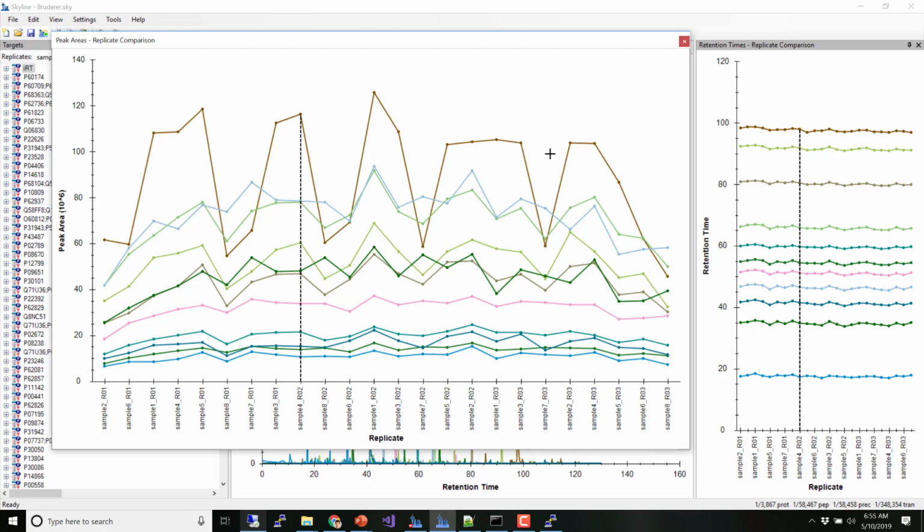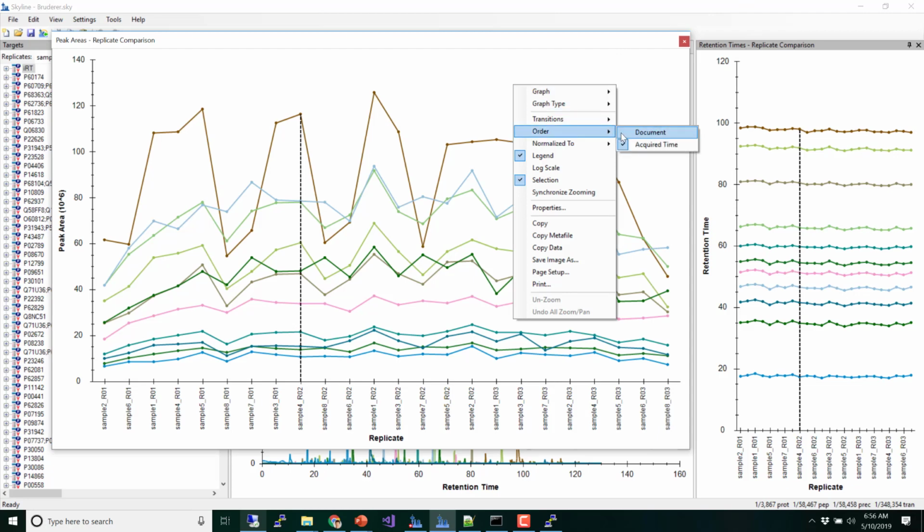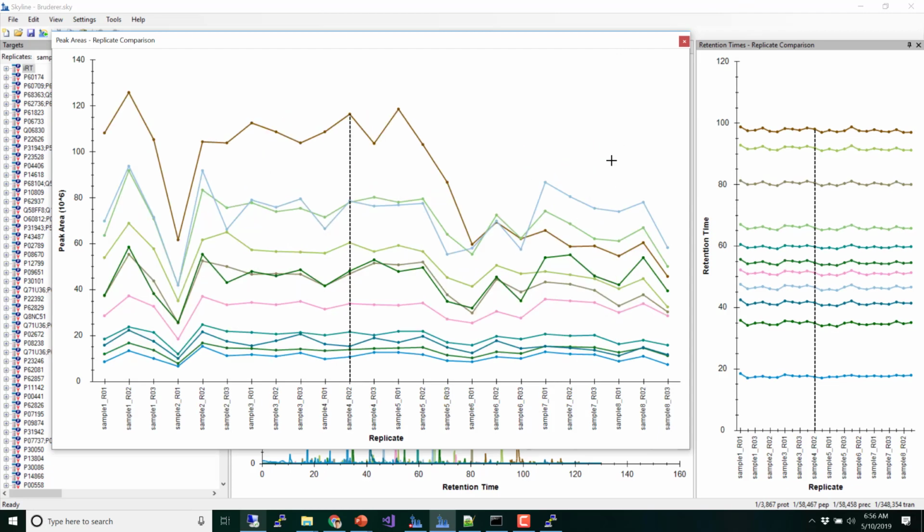And so, are we happy with that order? Do we get a warm fuzzy feeling if this were the order? Like, what were people hoping to see in terms of the order? You're at a statistics thing. You should have some ideas of what's a good sample order. Yeah. So if this were really the order, this would be terrible. Like you'd be like, what did you do?